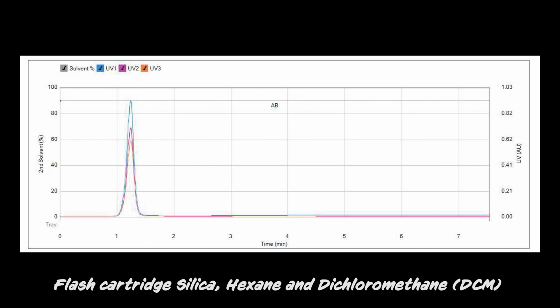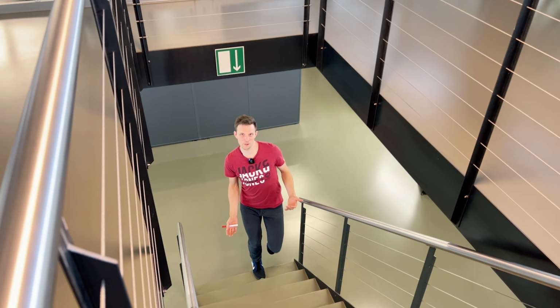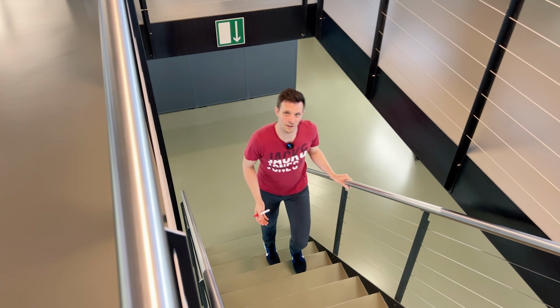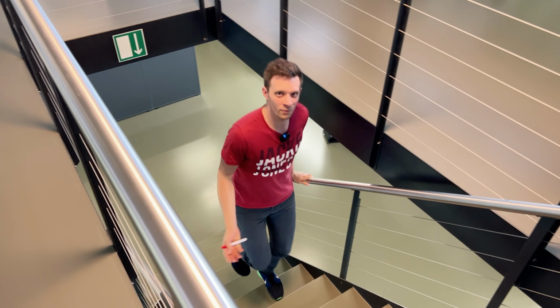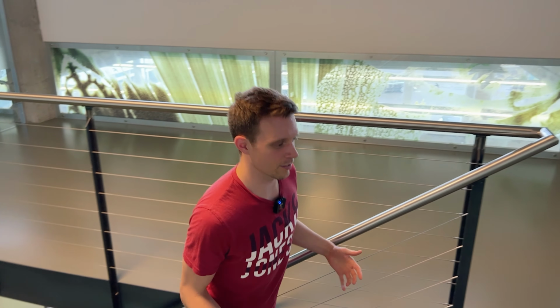Depending on the application, the solvent strength must always be taken into account, as this significantly influences the runtime and the separation. I hope I was able to give you a good insight into the chromatographic parameter resolution and the influence of normal phase and reverse phase chromatography on the separation.